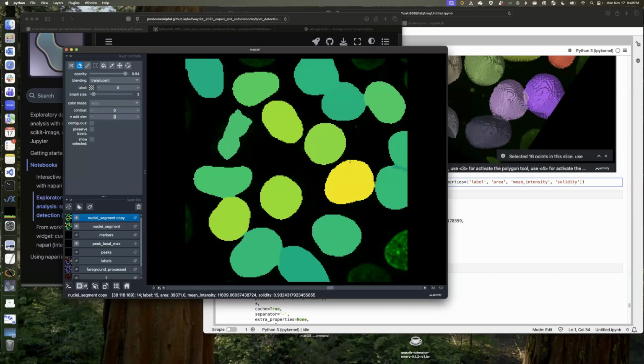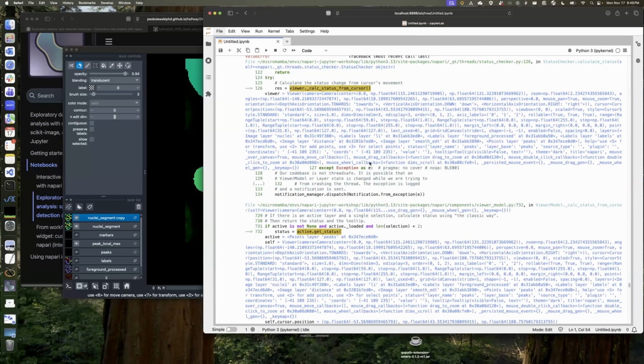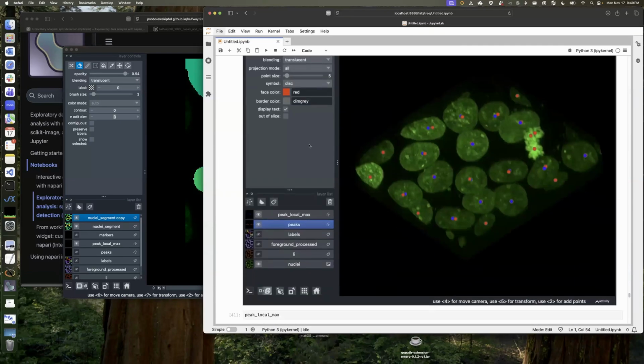And so what we should do is adjust the parameters of what we did in our notebook to get a better segmentation, where the two objects are well segmented automatically rather than doing it manually. Niels, your question about functionality related to Fiji.